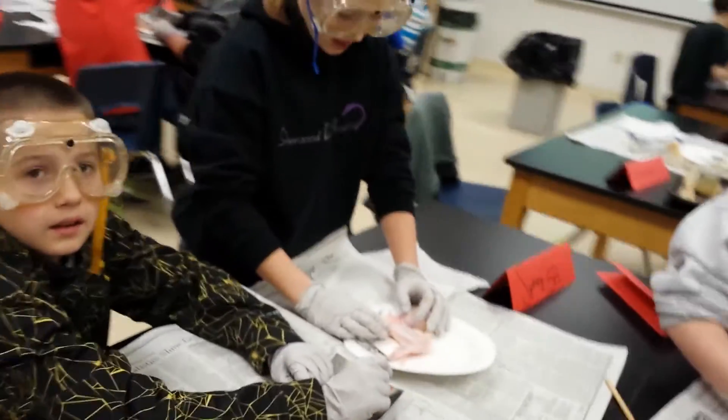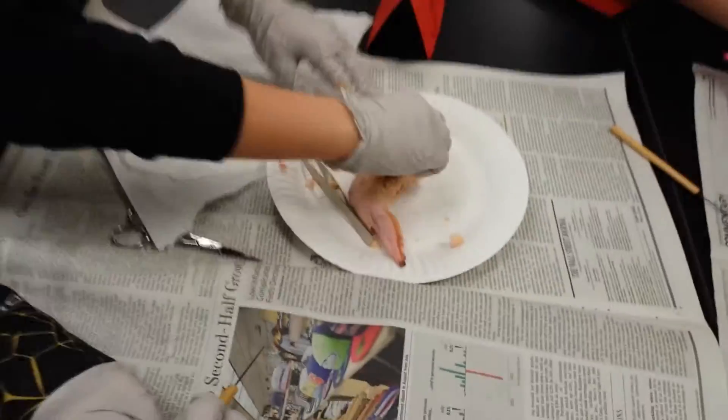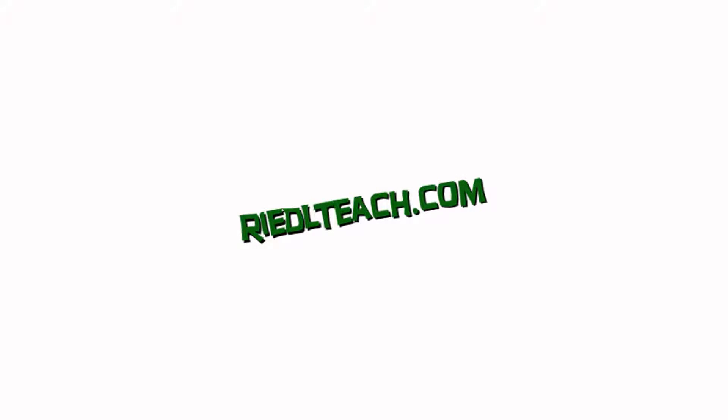Need help? Yeah, we can get help. Oh yeah, the skin has a hard time coming off, huh? Yeah, I'm just touching this.